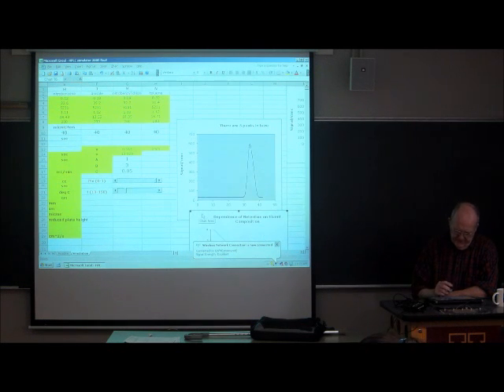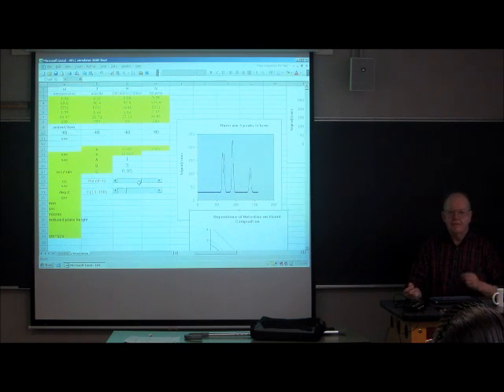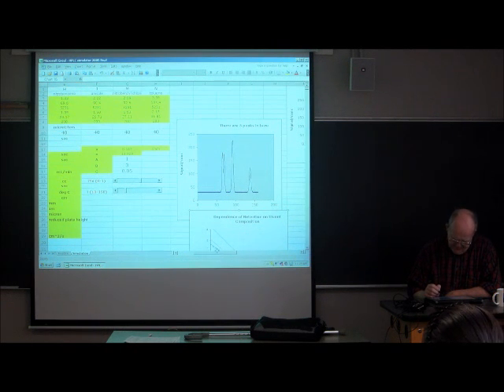So if I just get that out of the way, and I go to somewhat more reasonable conditions, I'll just arbitrarily go there. You see that there are actually at least 4 peaks, but there are 5. I'm not going to show you what the answer is. But you may want to adjust both the mobile phase composition and the temperature. That's the first part of the problem. And when we do reverse phase, you'll understand that a little better. That's really not the central issue in this problem, in this assignment, though.